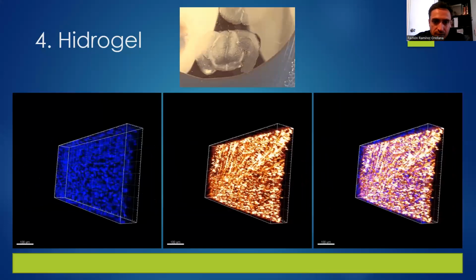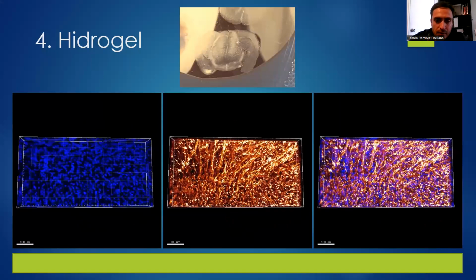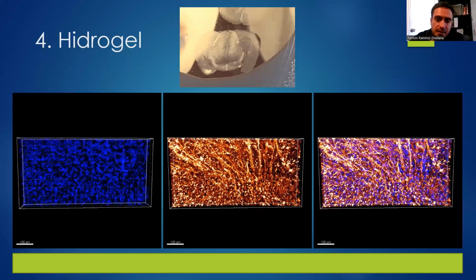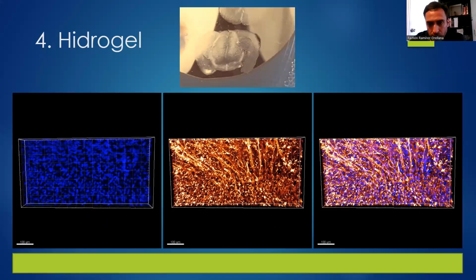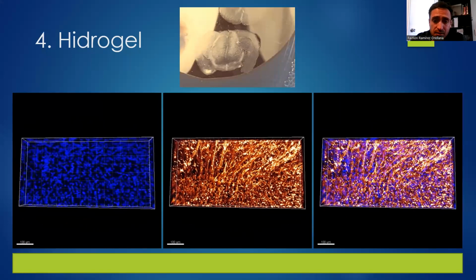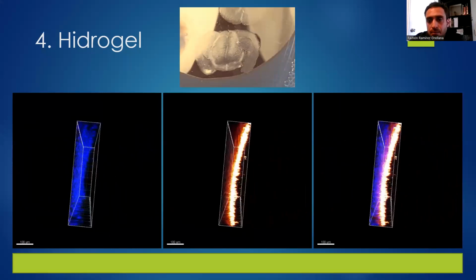En el caso del cerebro, hemos logrado visualizar sin problema, al menos de la técnica clarificada. Ahí les voy a comentar luego otros problemas que hemos tenido, que es lo de la pregunta que hicieron en la charla anterior, que es la penetrabilidad que tienen los anticuerpos o las tinciones luego de realizar esta técnica, ¿ya?